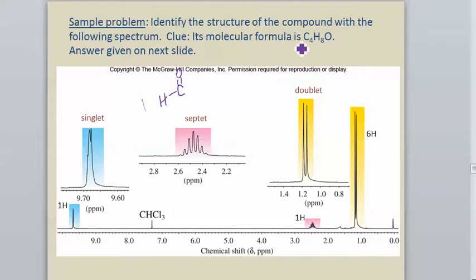So anyway, that takes care of one of my 4 carbons, takes care of my oxygen and one of those 8 hydrogens. Well, what's left is a group of peaks. This one's worth 6 hydrogens, and then this one is just worth 1, so that's my other 7 hydrogens, and so 6 of them are equivalent, and then there's 1 that's separate from those. And this doublet septet pattern is something we've seen before that tells me how the rest of those carbons should be put together. Anyway, think about the rest of this and what you can do to draw a structure that will match this.